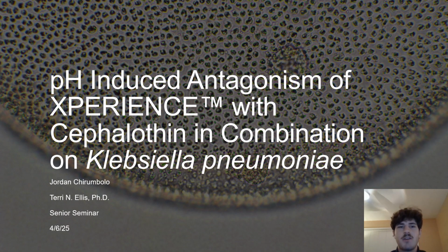Hi, my name is Jordan, and I'm going to be going over pH-induced antagonism of XPERIENCE with cephalothin in combination on Klebsiella pneumoniae, with my mentor being Dr. Ellis.